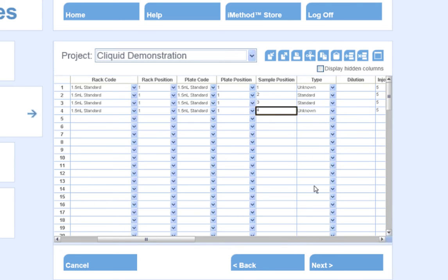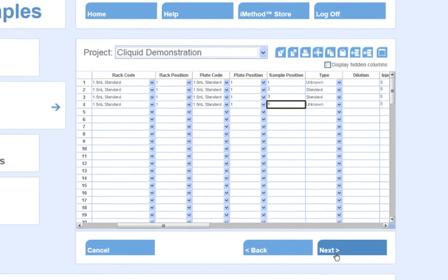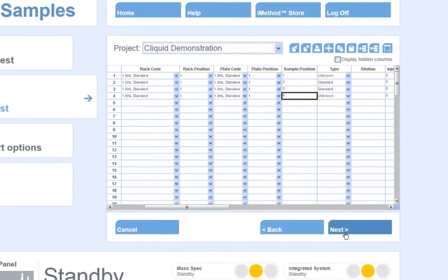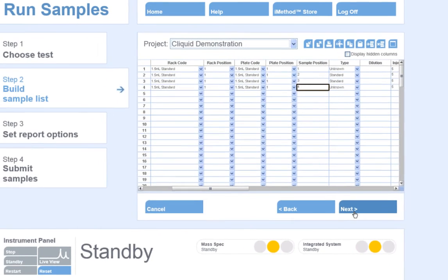I will click Next once I have completed setting up the sample table for analysis.